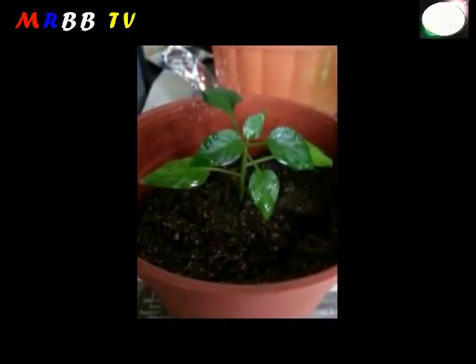It had grown approximately 1.7 cm and developed newer leaves.